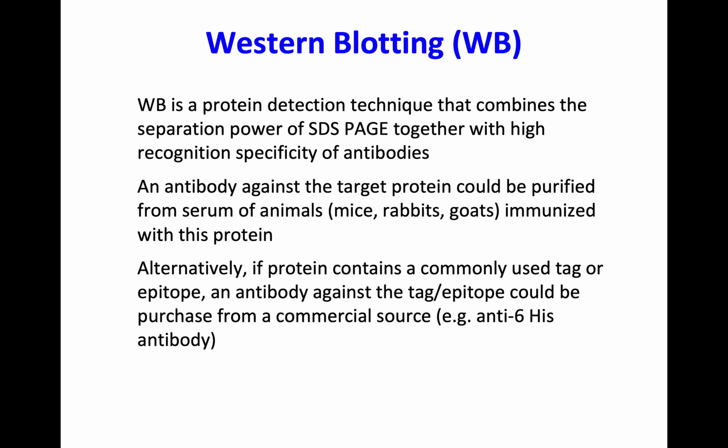This is done by Western blotting. I'm sure you have heard of Western blotting. Western blot is to detect protein. You have different kinds of blotting, right? How many blotting types do you know? Western is for protein. When you have Southern or Northern, or reverse Northern, you actually need nucleotides, but Western is for protein.